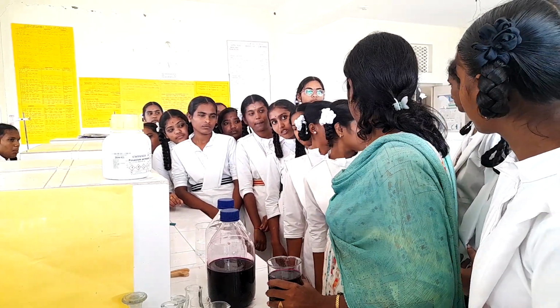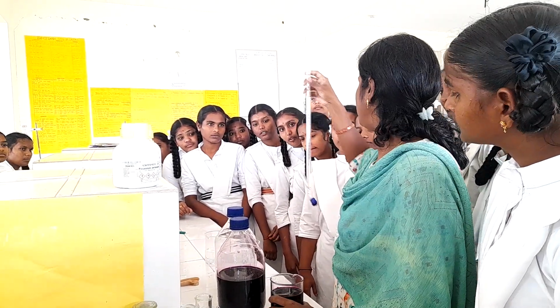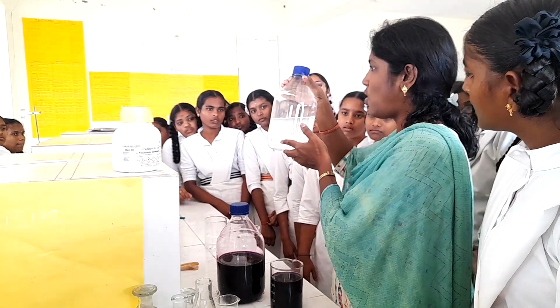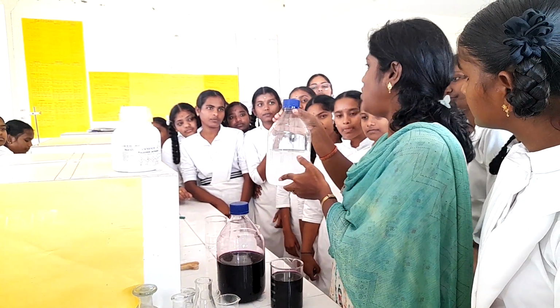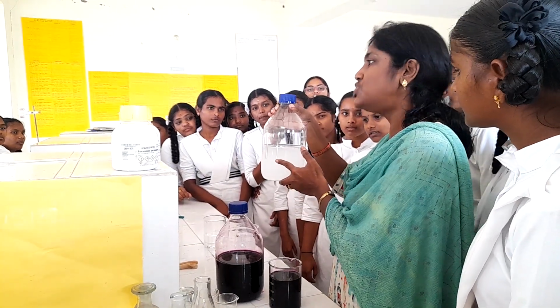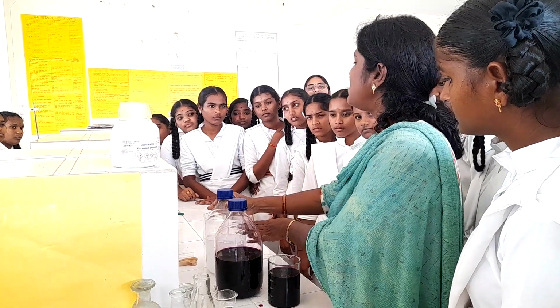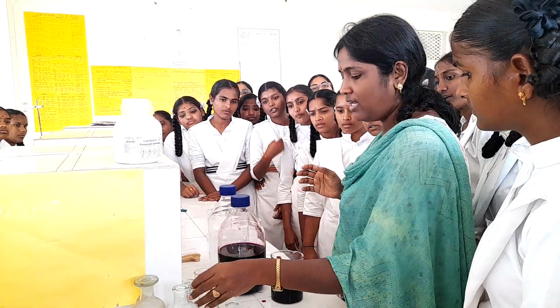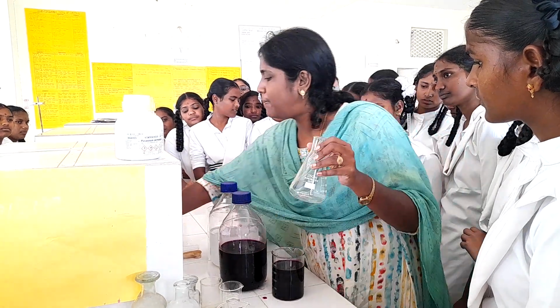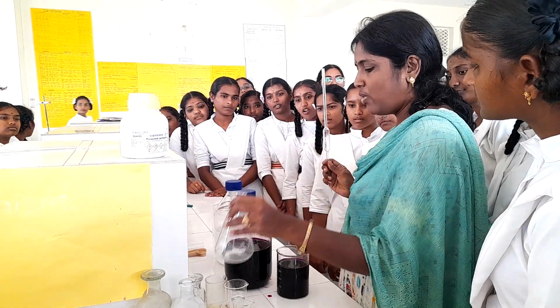Can I have it? Yes. So in this burette you are going to fill the KMnO4 solution. Similarly, we have been provided with oxalic acid. I am not going to reveal the concentration of oxalic acid, because you have to calculate it. So this oxalic acid must be taken in a conical flask using a pipette. Using a pipette you are supposed to take 20 ml of oxalic acid into the conical flask.